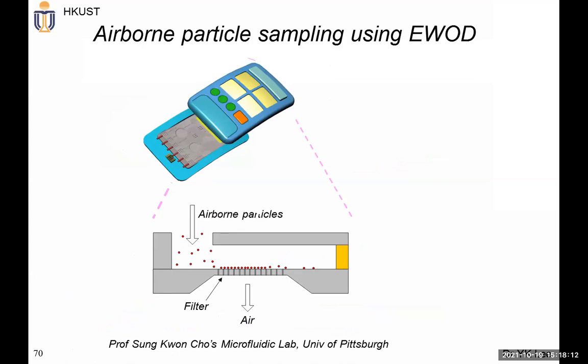So you may have some micro filters and then a droplet controlled by voltage, an electrowetting-based droplet. This was done by Professor SK Cho.